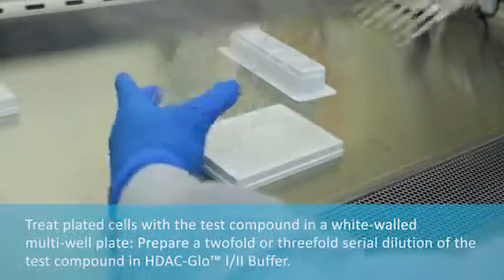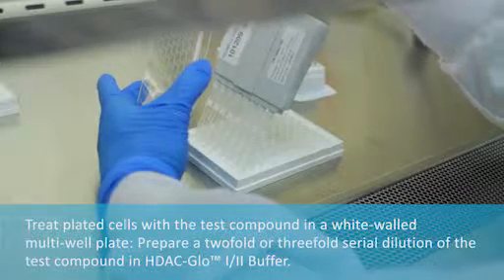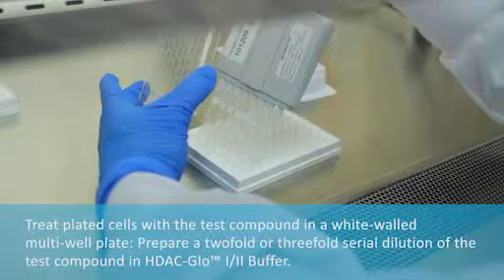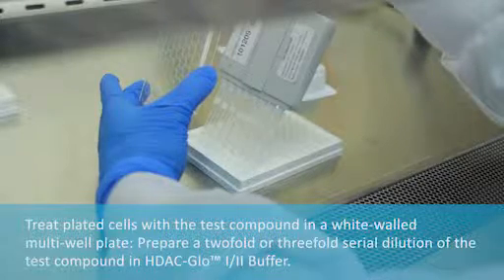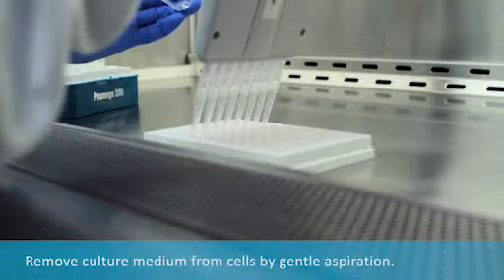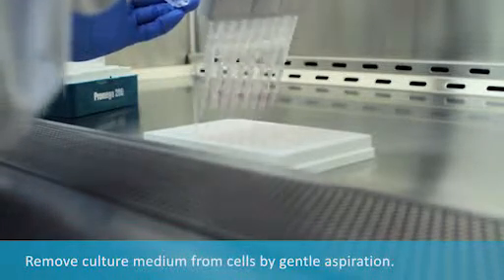Treat plated cells with test compound in a white-walled multi-well plate. Prepare a two-fold or three-fold serial dilution of the test compound in HDAC Glow 1-2 buffer. Remove culture medium from cells by gentle aspiration.